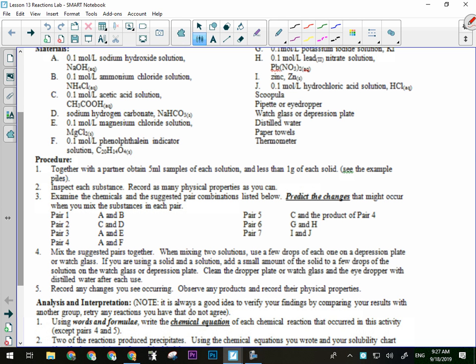Each time we mix different reactants, what are we hoping to see? Okay, we're hoping to see different products. What's that going to look like? Oh, chemical. Okay, we can't see chemical properties. What do I see? Okay, I'm looking for the signs of a chemical reaction. Each time I mix things together, I should see something that indicates a chemical change has occurred.